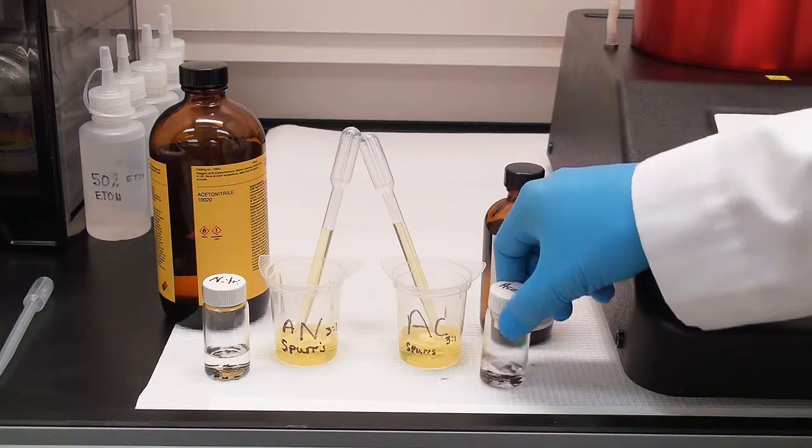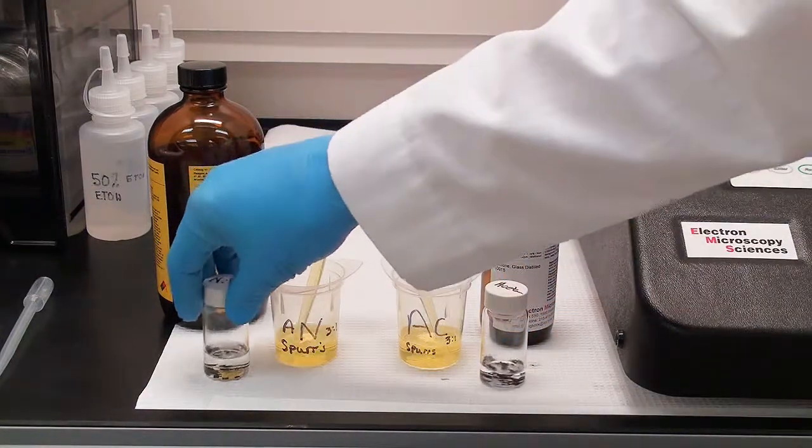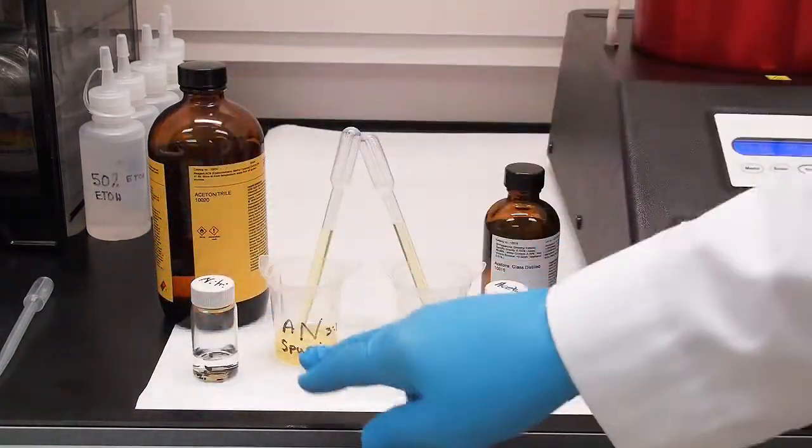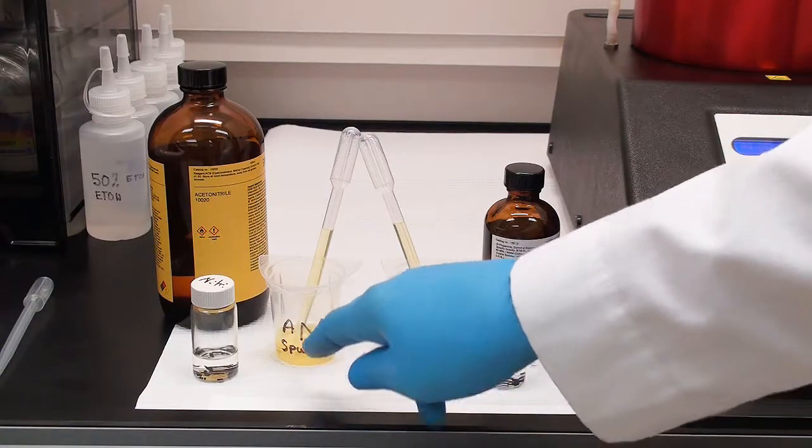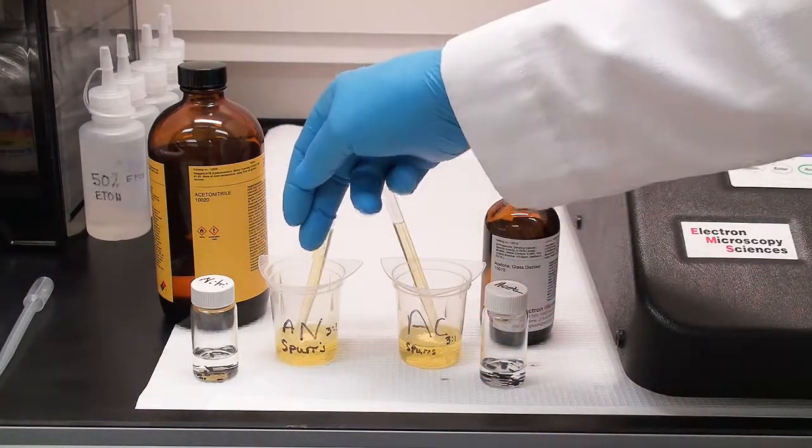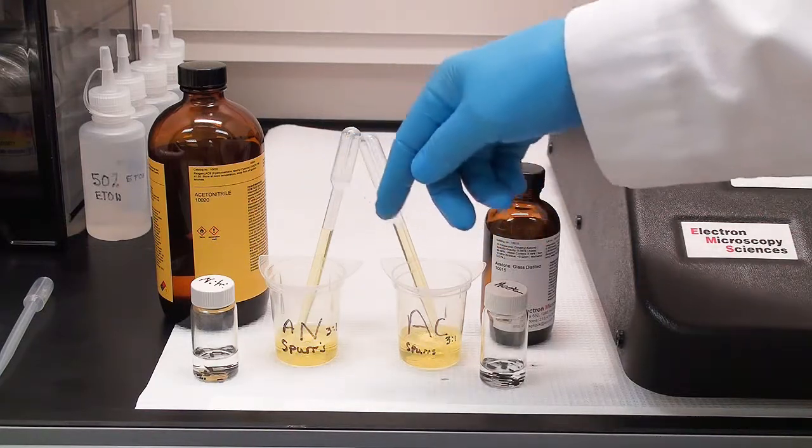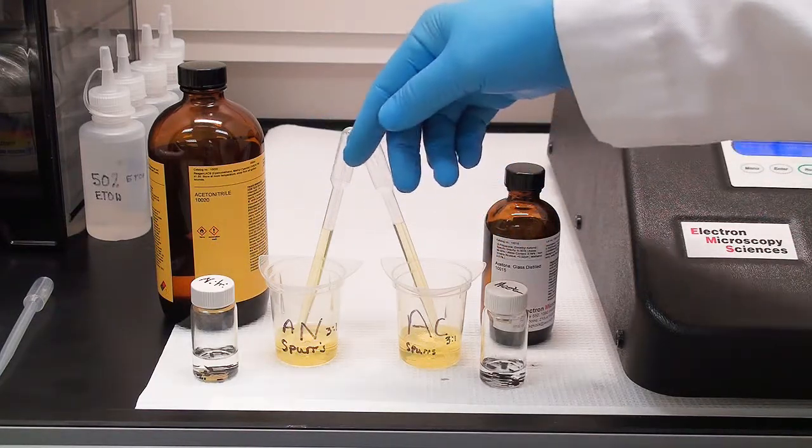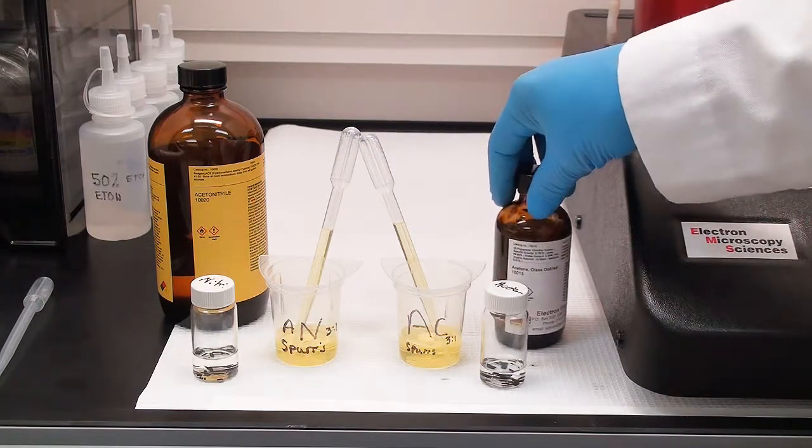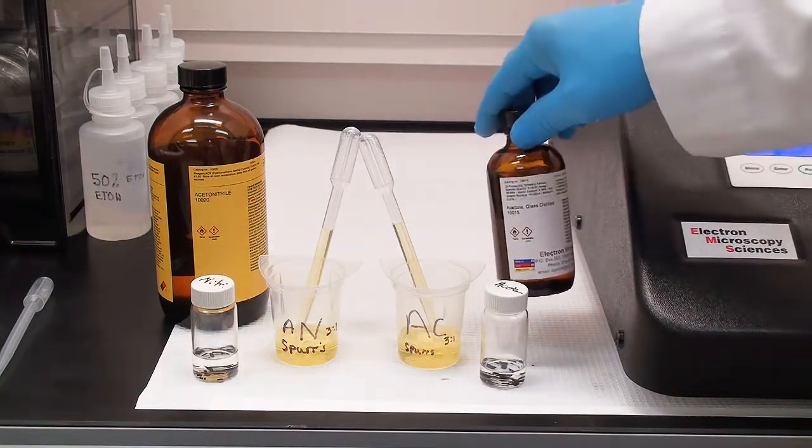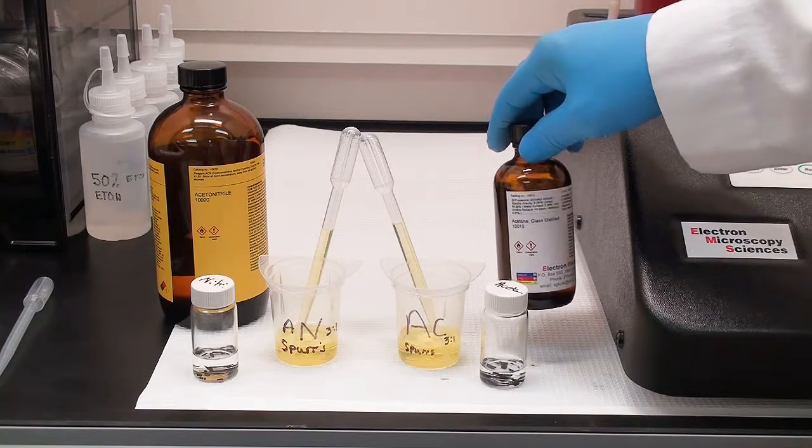I've processed two different samples of plant and some kidney. The kidney is really for my morphologic control. And I have Spurs resin with both a 3 to 1 ratio of acetone to spurs and acetonitrile to spurs. I always use the glass distilled acetone to avoid any type of moisture contamination.